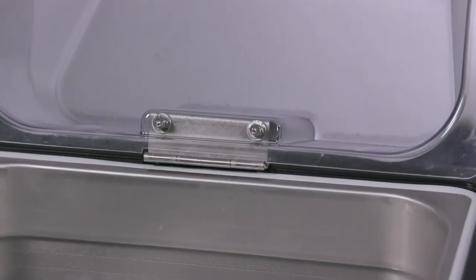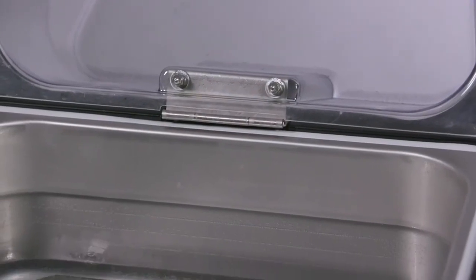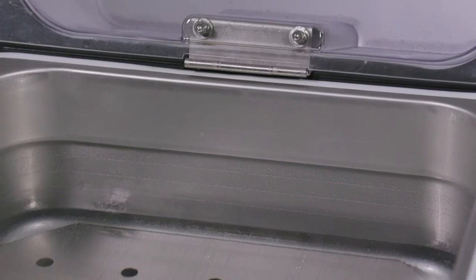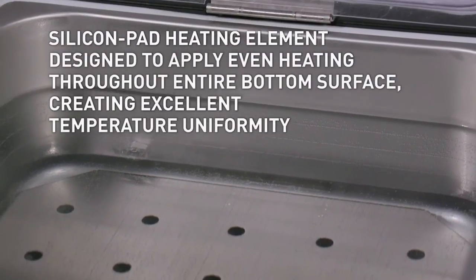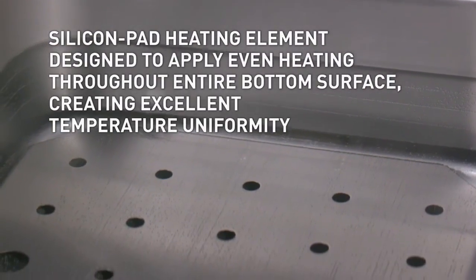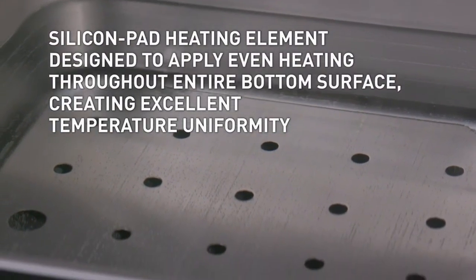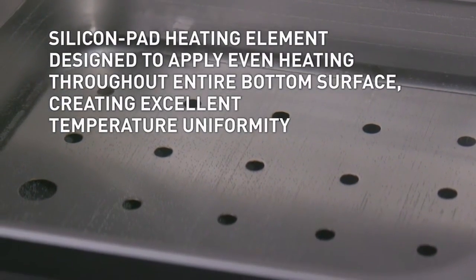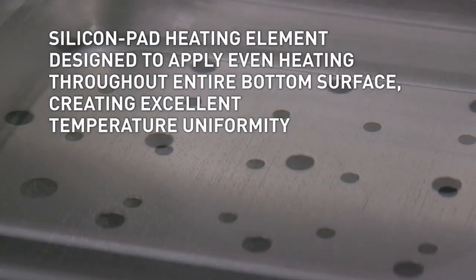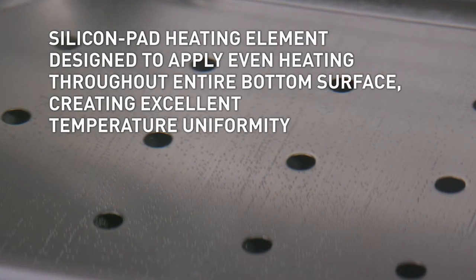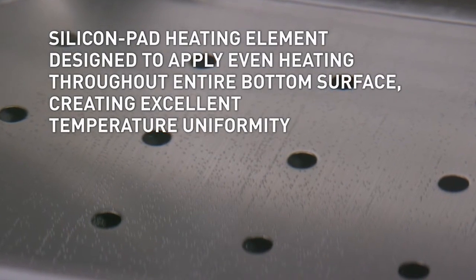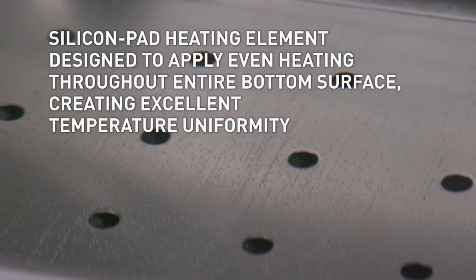The silicon pad heating element was specifically designed to apply even heating throughout the entire bottom surface of the tank, creating excellent temperature uniformity.